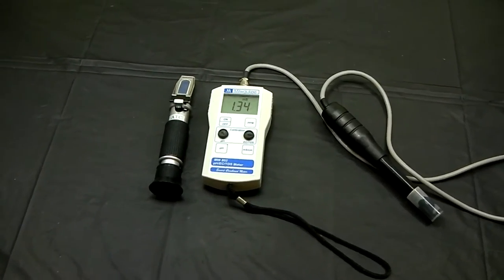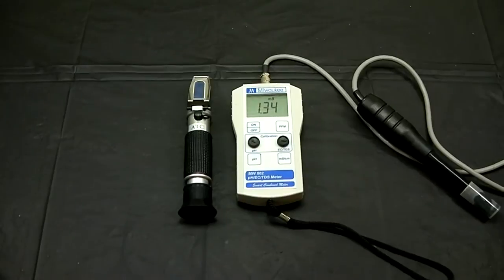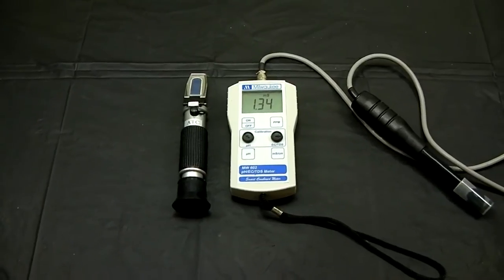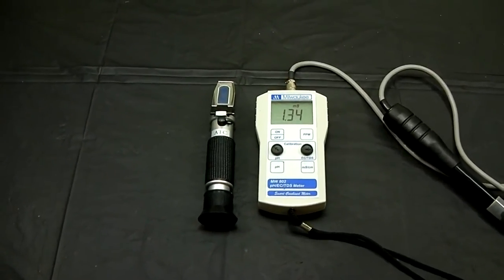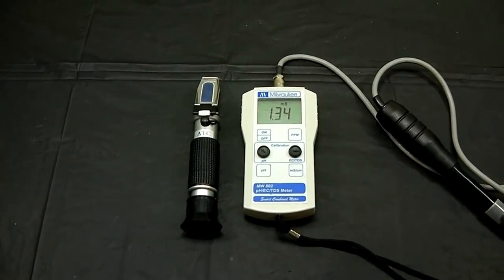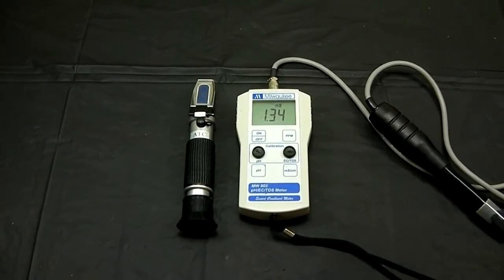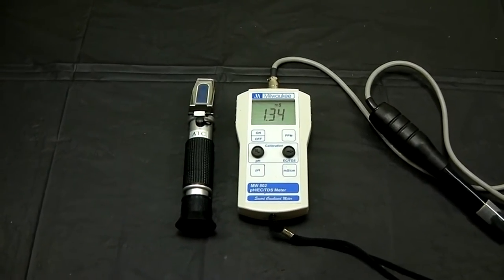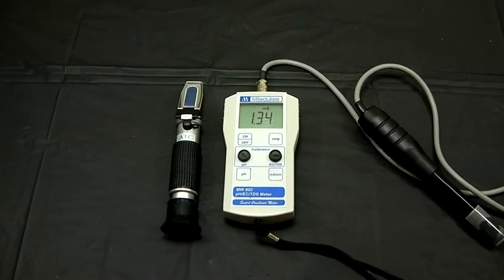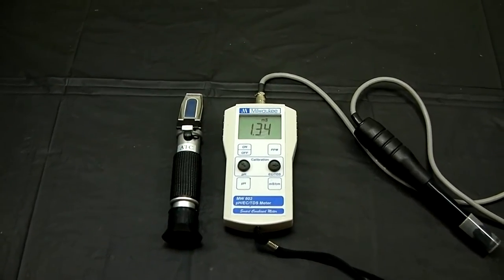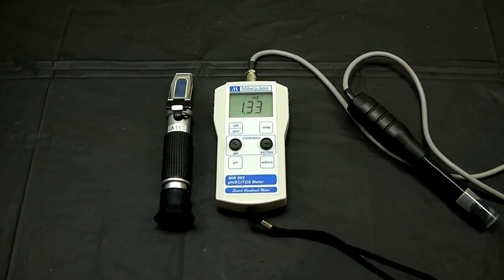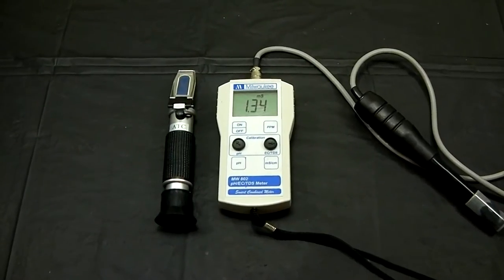After reviewing the video of the Brix Test, it looks like I came out closer to a 9.5 to 10 on the percent scale on the Brix, which is more in line with that Roma tomato that I grew. That was a Rio Grande, which I've never grown before in my system, so that was new to me. But Roma tomatoes in general, they're a lot firmer, less juicy, more for sauces and things like that. The bigger slicing tomatoes tend to come out a lot higher in the sugar. But a 9.5 to 10 on most scales, that puts it in the good to excellent range. So, I'm pretty pleased that for the first time on that from seed, I can't complain.